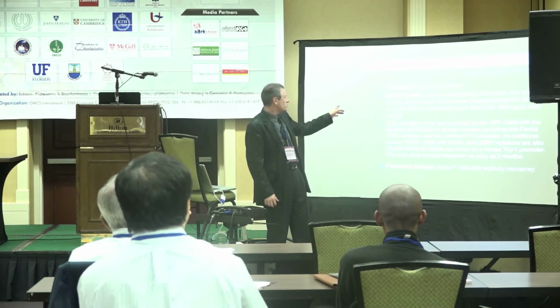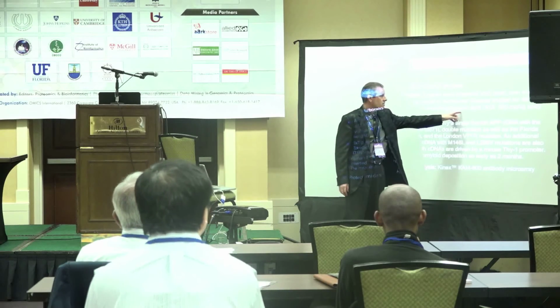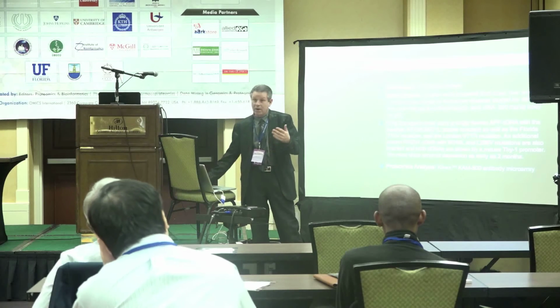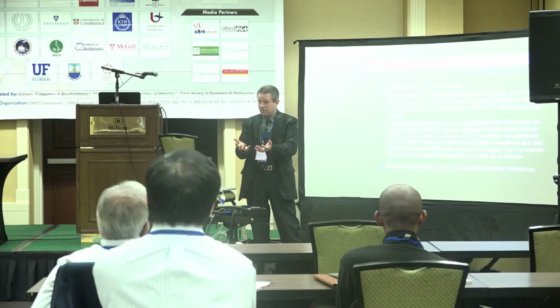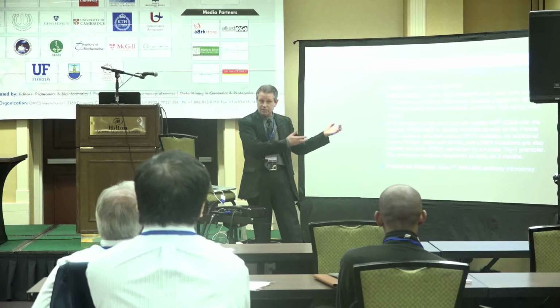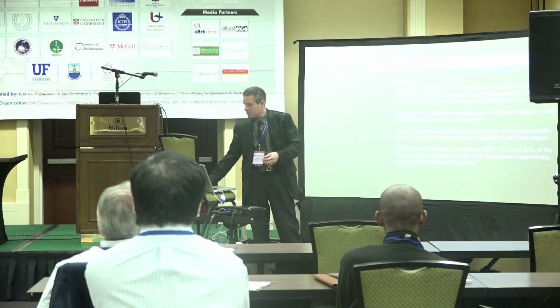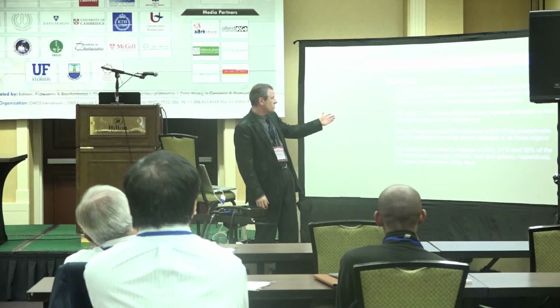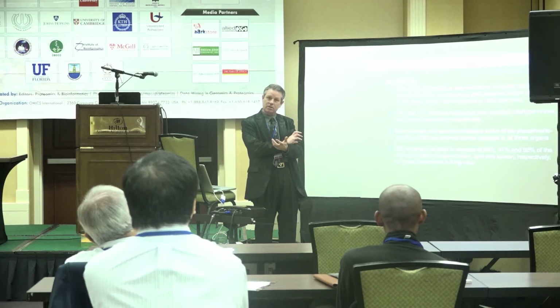And these mice were treated with aurintricarboxylic acid, ATA, for 48 days, and then we did the profiling, because their behavior is like they're normal, even though they're genetically like Alzheimer's, and if not given the ATA, they would develop the Alzheimer's-like symptoms. So we looked at these mice using our microarrays, and in short, we were able to reveal changes with our antibodies in specific proteins, and that the ATA reversed the changes that we were seeing in the models.